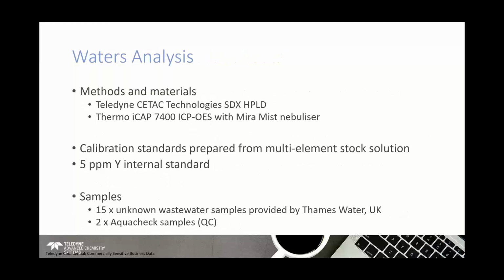So just to give you a few more details on how this can be applied to waters analysis. We did some work previously with Thames Water in the UK and Thermo Fisher Scientific in the UK, whereby we took 15 unknown wastewater samples, which were provided by Thames Water, and 2 AquaCheck QC samples. And we've analysed these with respect to calibration standards, and we've got internal standardization in there as well, via the SDX and Thermo ICP OES instrumentation. So we've taken these samples and run them.